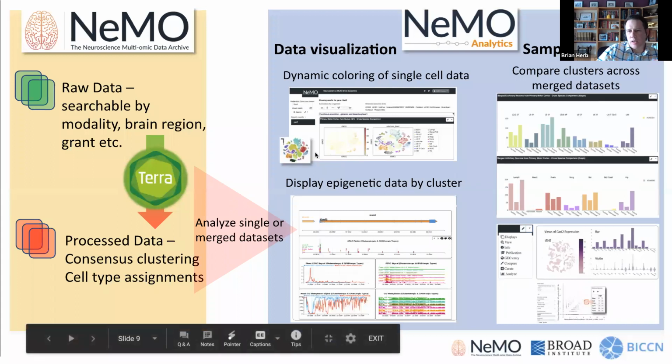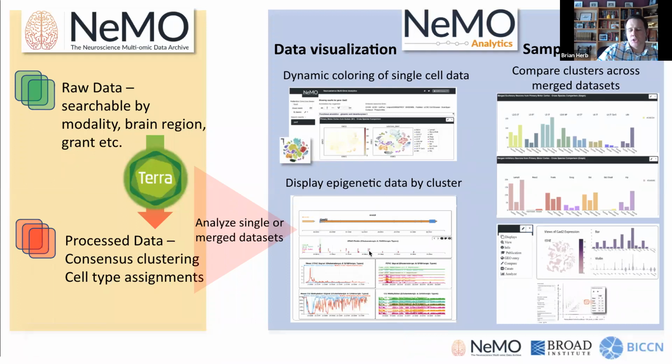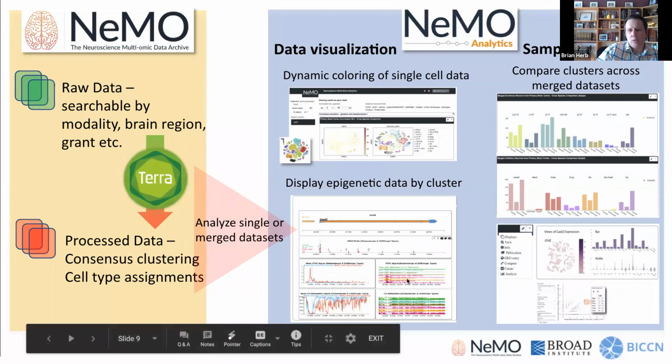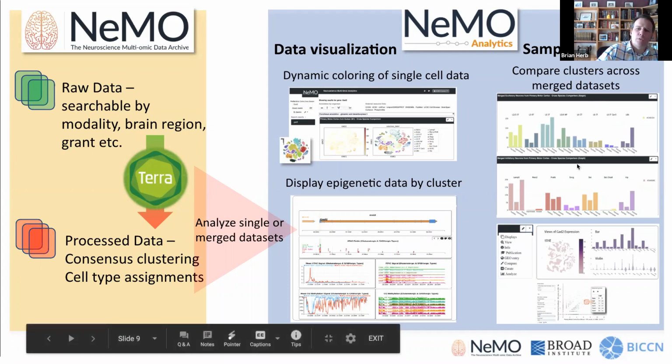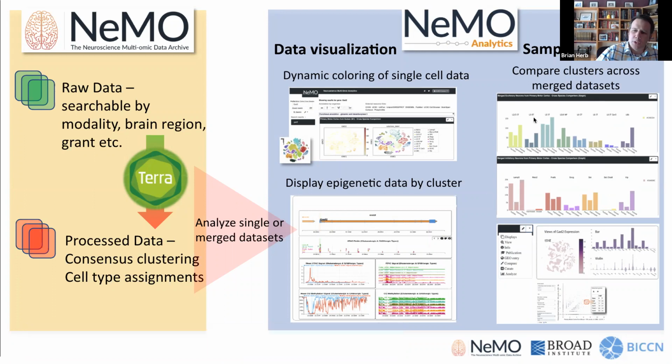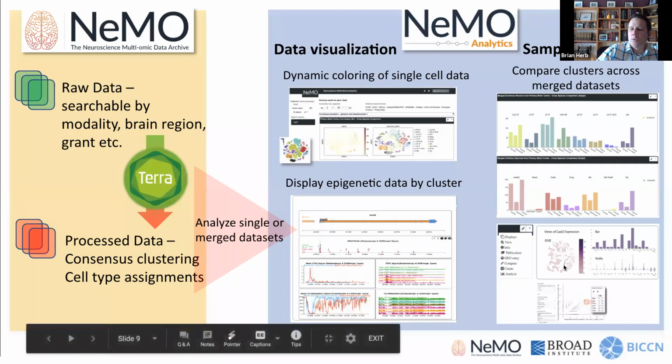Again, a lot of the papers are on there. In the second portion of this talk, Jairam is going to go through how we use EpiViz for displaying epigenetic data in a genome browser view. And I'll also be walking you through some tools. So the idea is that you have the data presented in the paper. There's other ways to analyze that data, be it comparisons. There's many plots that you can create, and also gene expression differences that they can tackle.